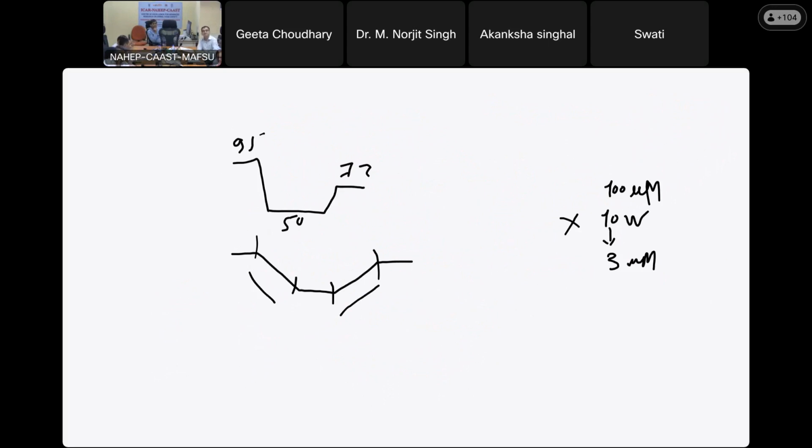And once you have finished your PCR, you need to purify the PCR. Okay. So there are again two techniques for the purification of this terminator reaction. Okay. We call it terminator reaction. The first one is very fast. That means you need to remove your primers because you added your primer, right? You need to remove your primer. You need to remove all this garbage.